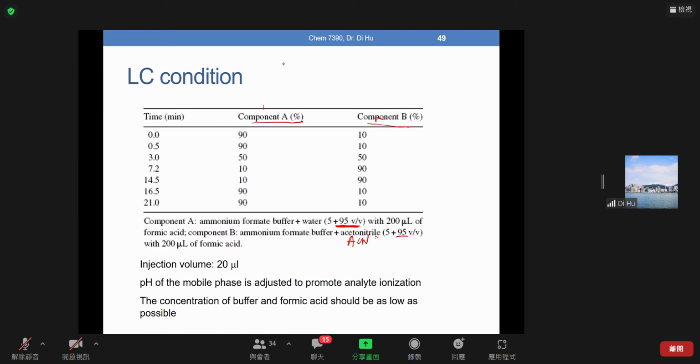And also when you are using ACN, the UV cutoff wavelength, I think it's 190, which is shorter than that of methanol. So that means it can make you more sensitive, or good for the short wavelength range. So that's why I talk a little bit more about this issue when you are choosing the organic modifier. Okay, so this is something that you think about.